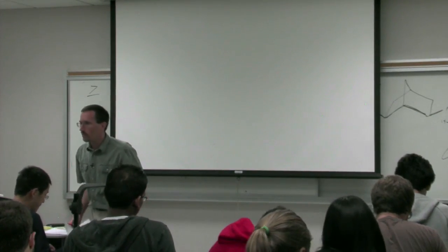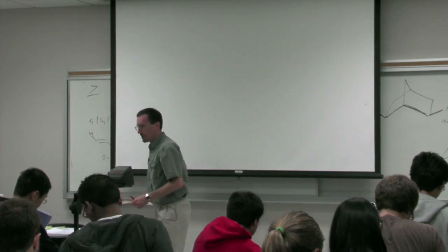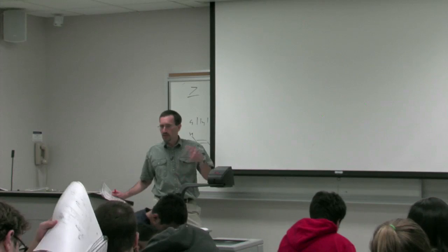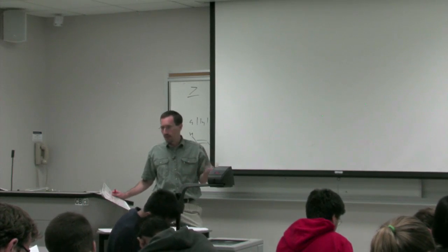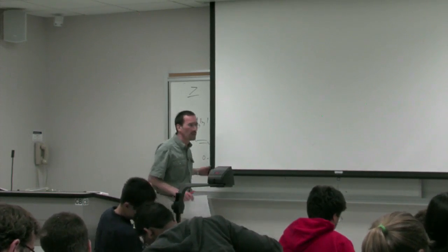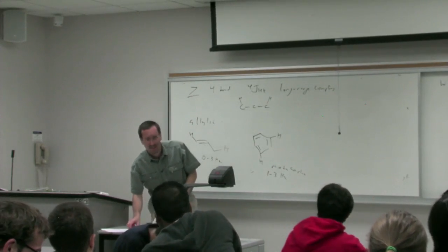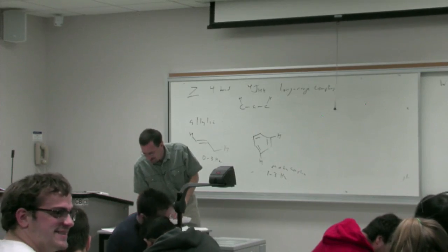We're going to talk more about first order splitting next time, and we're going to walk through some examples of doublets and triplets of doublets and doublets of triplets and doublets of doublets of doublets, and that'll prepare you for a workbook assignment that comes later on.